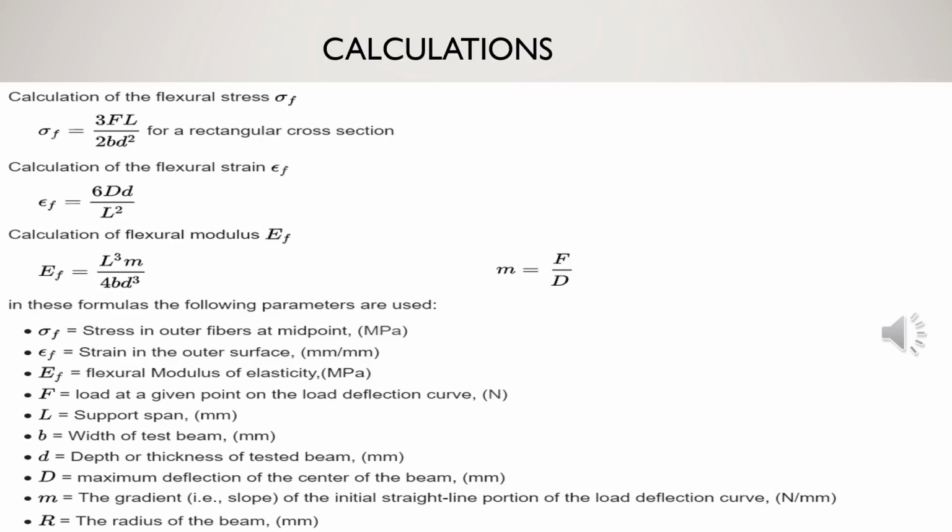Here is the formula given for the calculation of the flexural stress, which is 3FL upon 2BD squared, and for flexural strain it is 6DD upon L squared, and the flexural modulus of elasticity is L cubed M upon 4BD cubed, where M is equal to F by D.